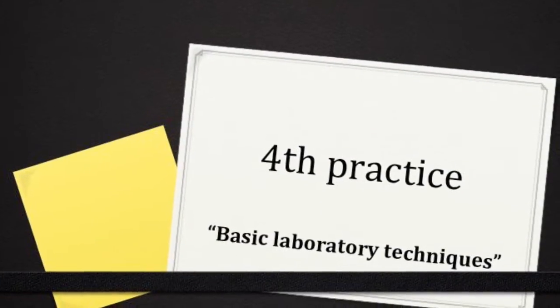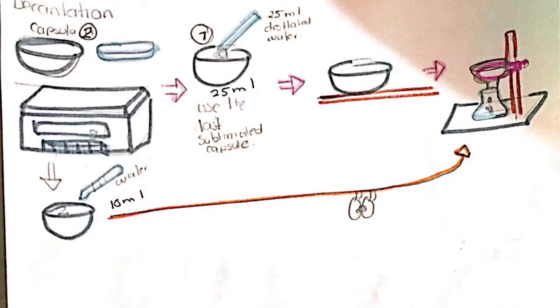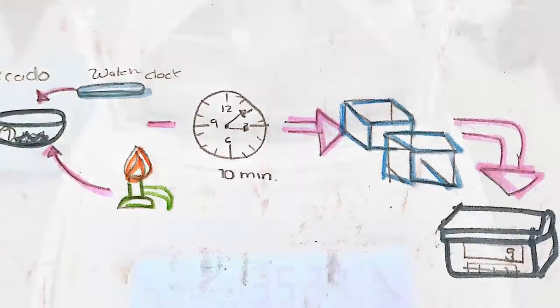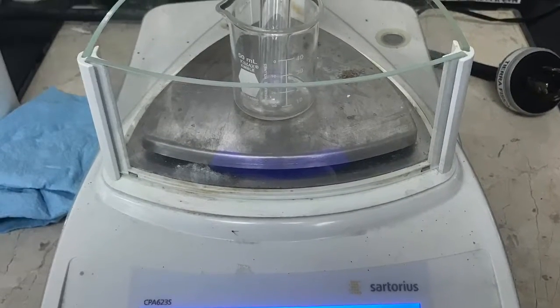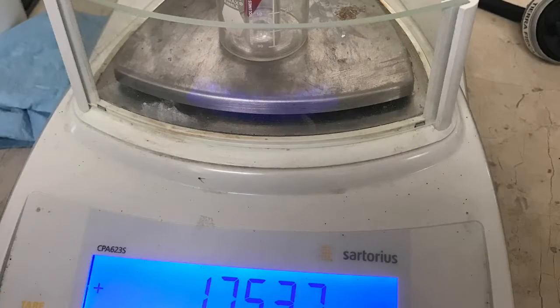The main objective of this practice was to use, identify, and differentiate the different methods of separation. The methods used were centrifugation, filtration, sublimation, distillation, and a separation of a solid mixture.